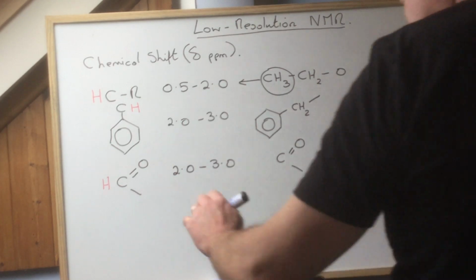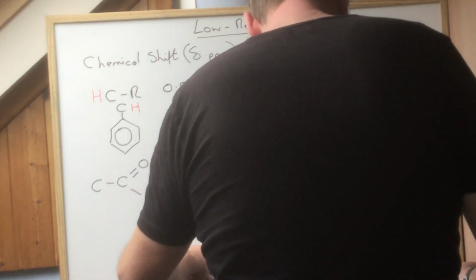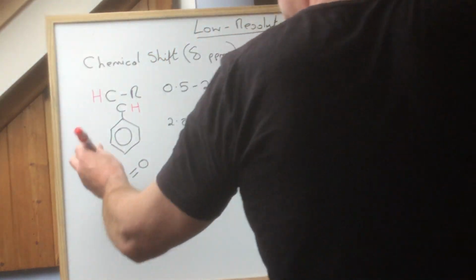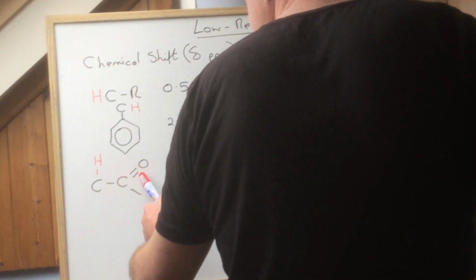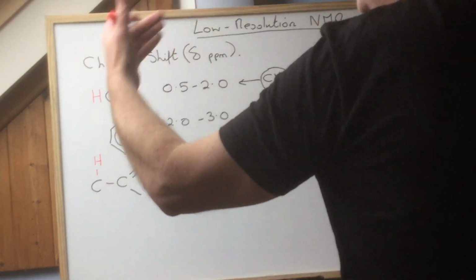You know what, I've cocked that. I knew I had, because they can only fit one on. See, deliberate mistake, just goes to show you make all these notes and then they go wrong. That chemical shift is for protons attached to a carbon which is attached to a carbon with a C double bond O. You've got to shift your brain a little bit further down the line.